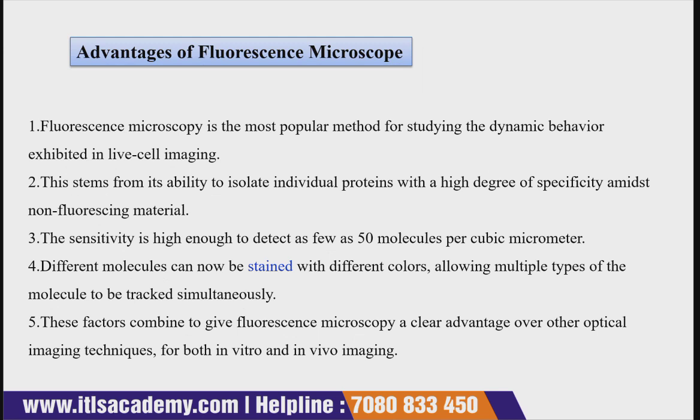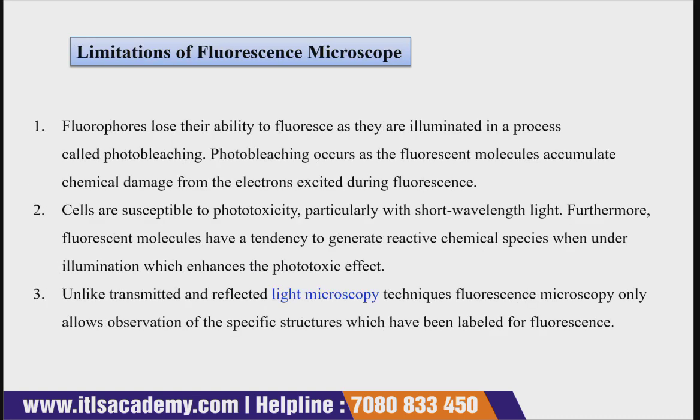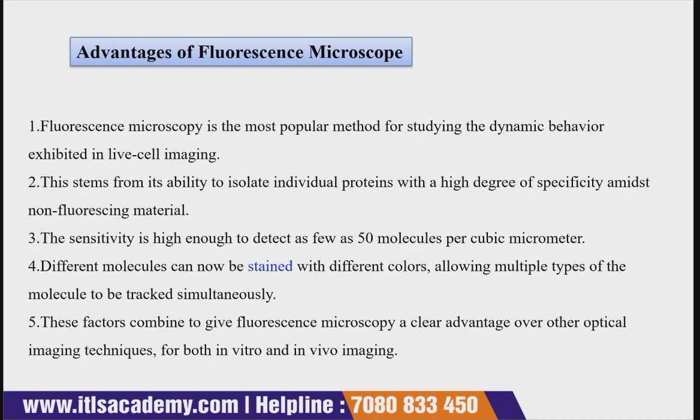Now let's see the advantages. Fluorescence microscopy is the most popular method for studying the dynamic behavior exhibited in live cell imaging. This stems from its ability to isolate individual proteins with a high degree of specificity amidst non-fluorescing material. The sensitivity is high enough to detect as few as 50 molecules per cubic micrometer.